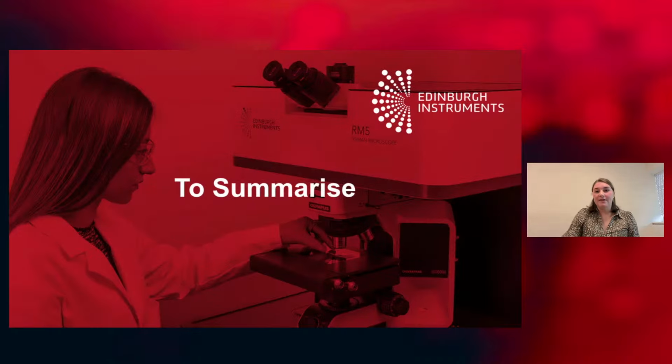So that really brings me to the end of the case studies there. As I mentioned, we went over an operando measurement using Raman. We looked at the degradation of electrodes, and finally the composition and effect of electrolyte changes in a battery.